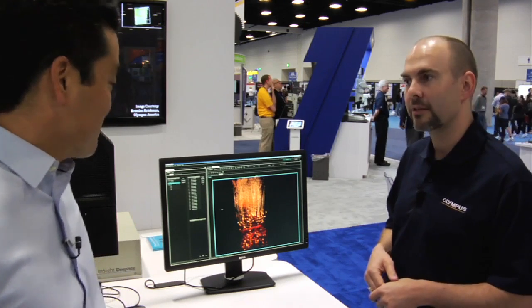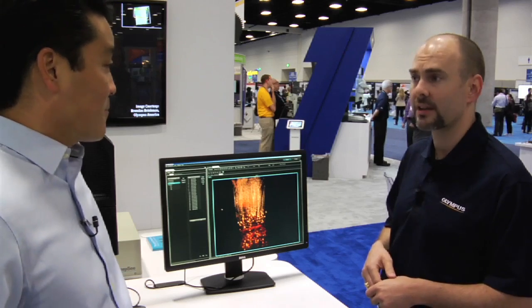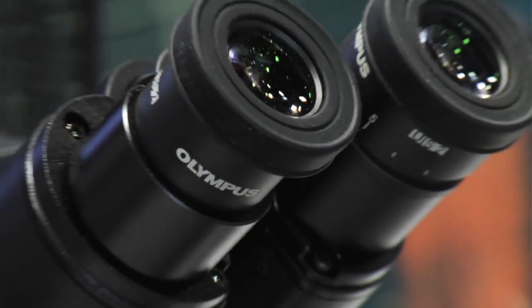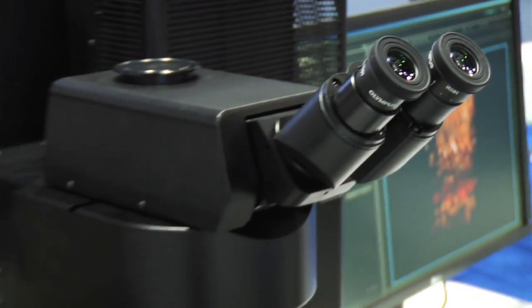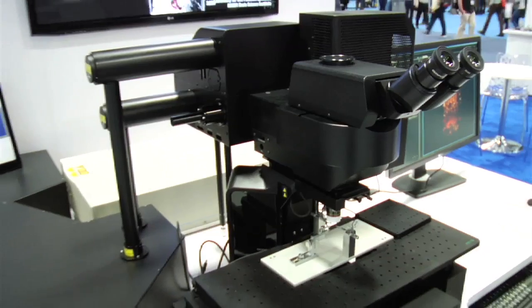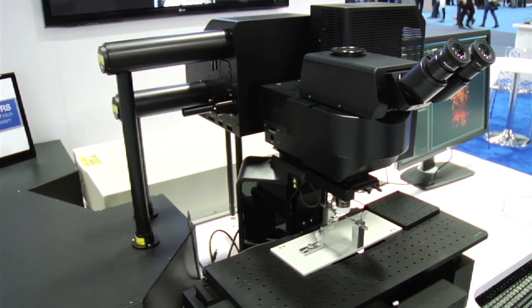Let's walk over here and I'll show you some of the light path and some of the other special things for optogenetic stimulation. Can you walk us through some of the technology behind how you're getting this amazing depth of field? There's a lot of engineering that went into this particular instrument and the things that we're able to achieve with it.